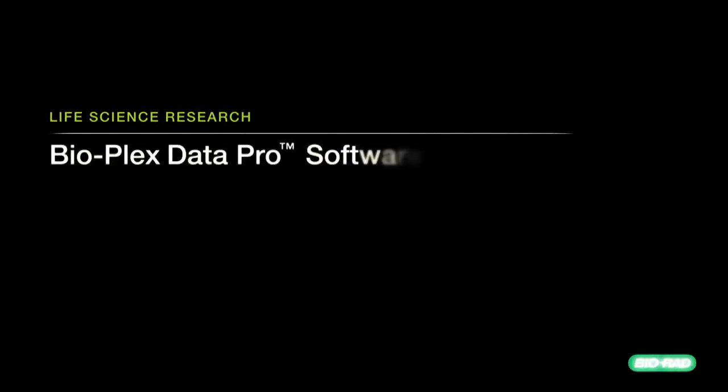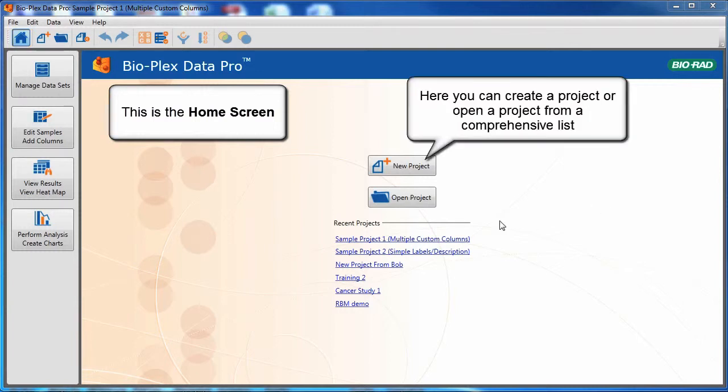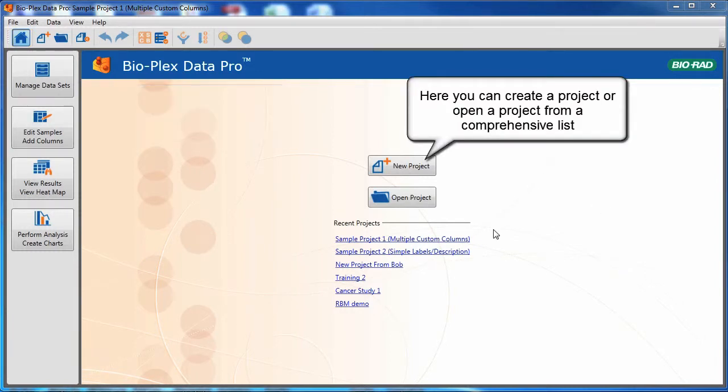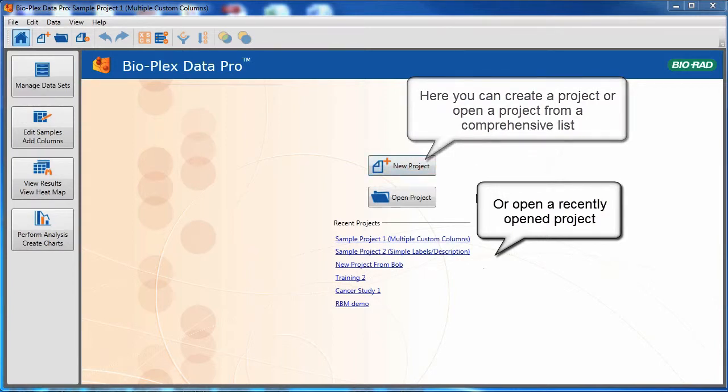Bioplex DataPro software is an analysis tool for organizing your data and visualizing results relevant to your biological system. The home screen provides easy access to basic functions. Here you can create a project or open a project from a comprehensive list, or open a recently opened project.